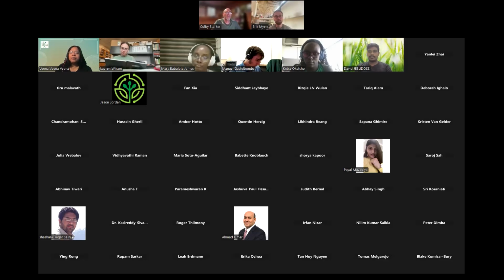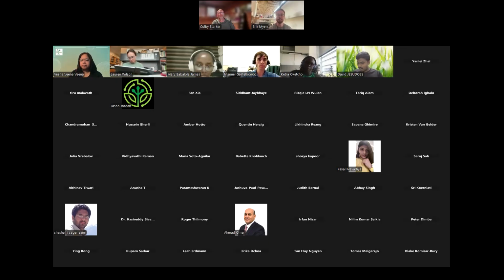Erik, for the interest of everybody who's attending, is Benchling accessible to everybody for free, or how does that work? Yeah, Benchling is free for academics. So you can create a profile and they give you, at least when I signed up, 3 GB of notebook space, file space, and whatever. So I can share a link in the chat.